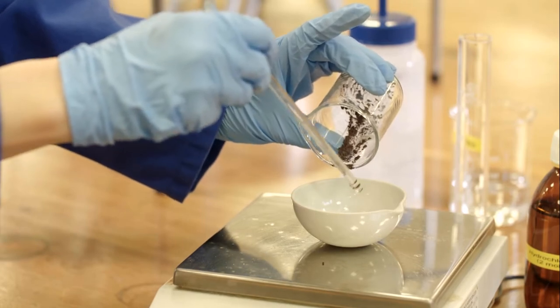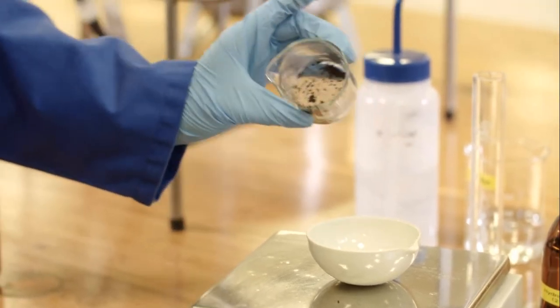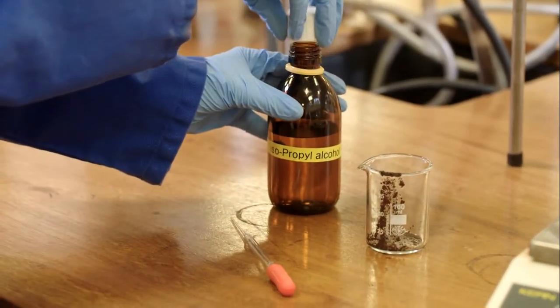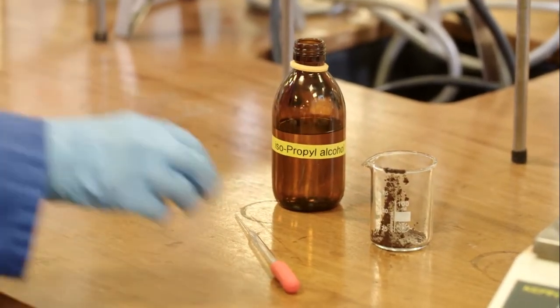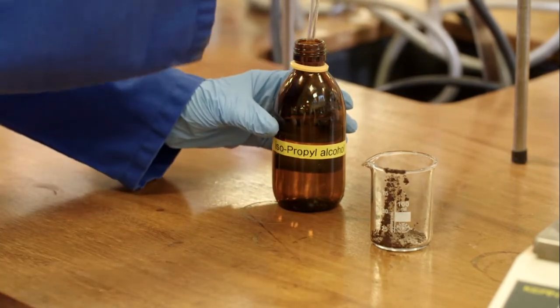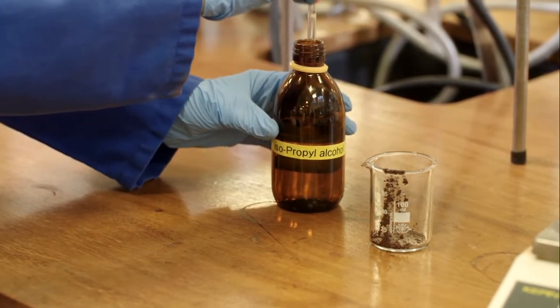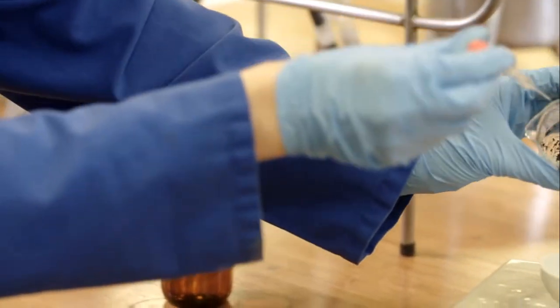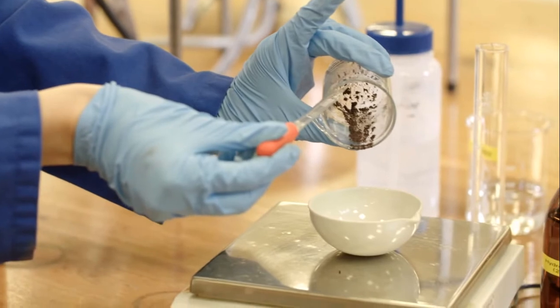The copper is carefully transferred to the evaporating dish using a glass rod. A small amount of isopropyl alcohol can be used to ensure that all the copper is transferred. This is repeated until all the copper is transferred.